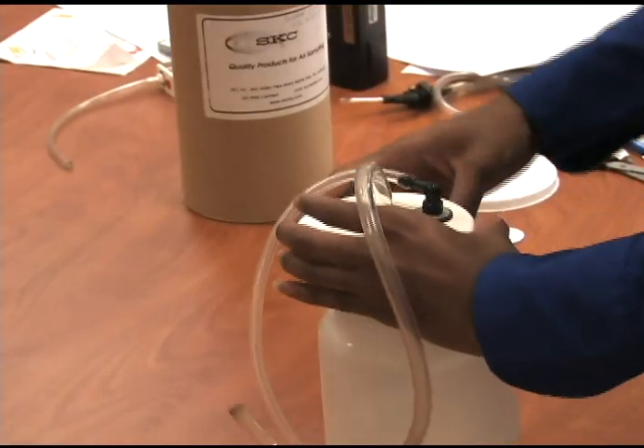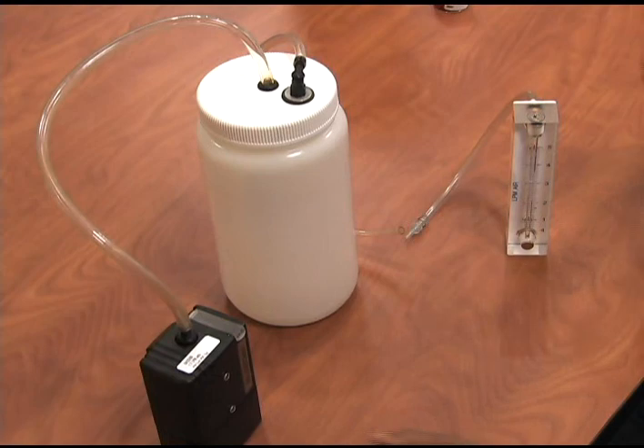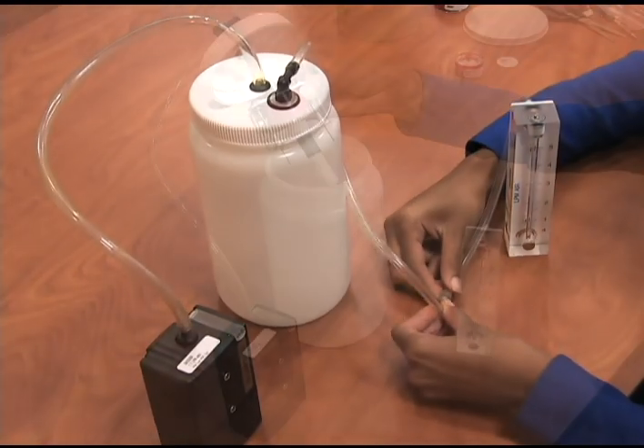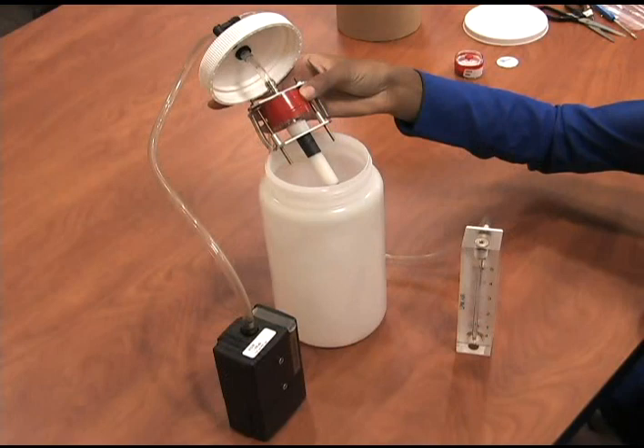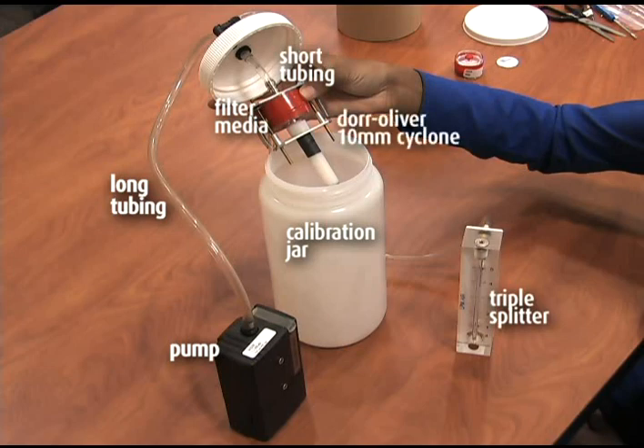Close the top of the calibration jar, then attach the tubing to the pump. Attach the second tubing from the jar to the rotometer. The order of the components for calibration is: pump, long piece of tubing to jar inlet, calibration jar, short section of tubing, filter media in place in the cyclone holder, 10 millimeter cyclone, then long section of tubing from the jar outlet to the rotometer.